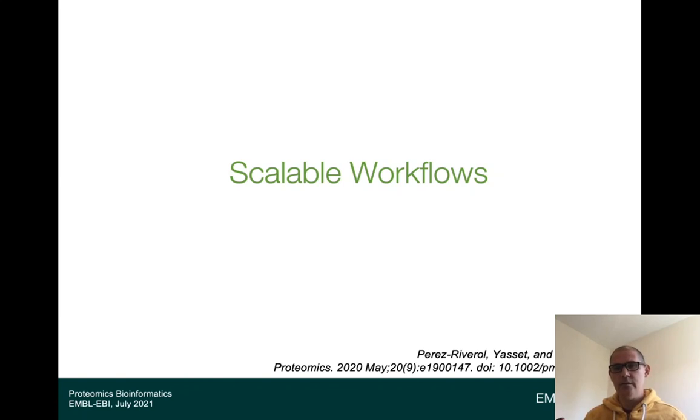workflow system. What a workflow system basically allows you is to take a task that you have defined, let's say identification of these mzML mass spectra with this software and this database, run that particular tool on one machine and get some results back.